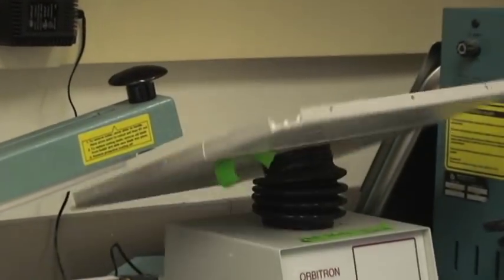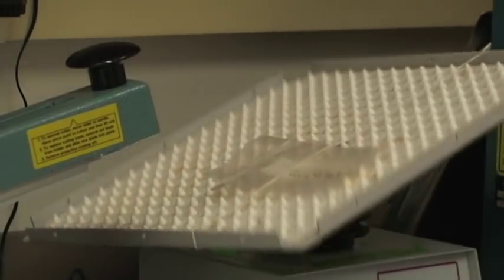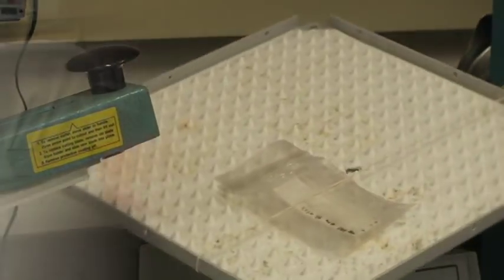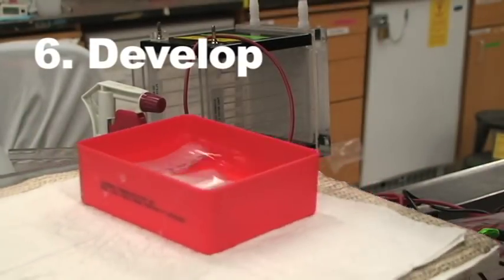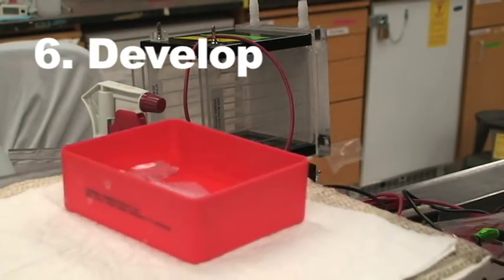Now the blot that's incubating with the primary antibody is left on a shaker overnight. The next day, this antibody will be washed, and the process repeated with the secondary antibody. These guys were in secondary, but now they're in PBS washing.